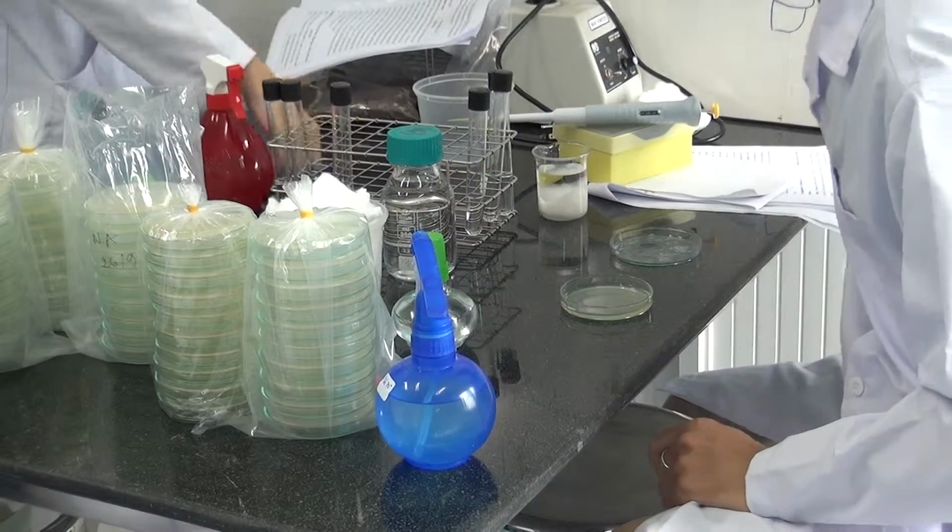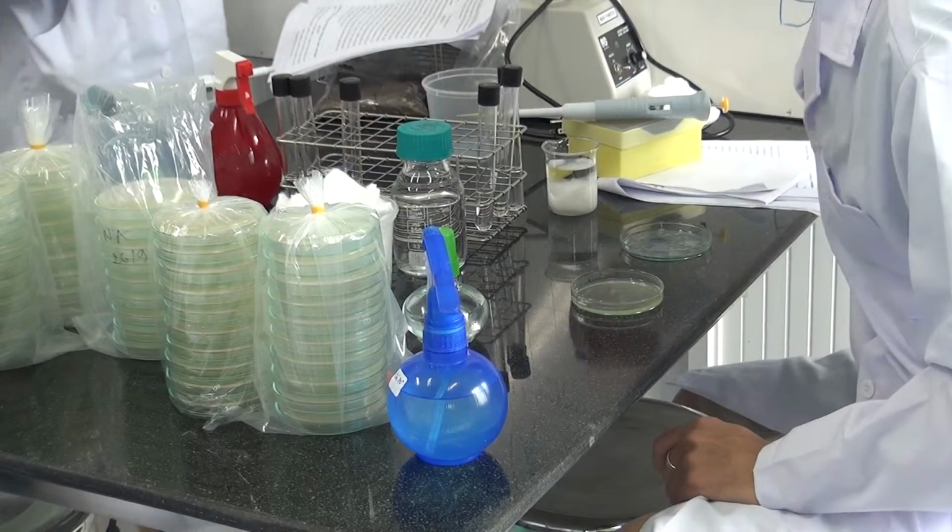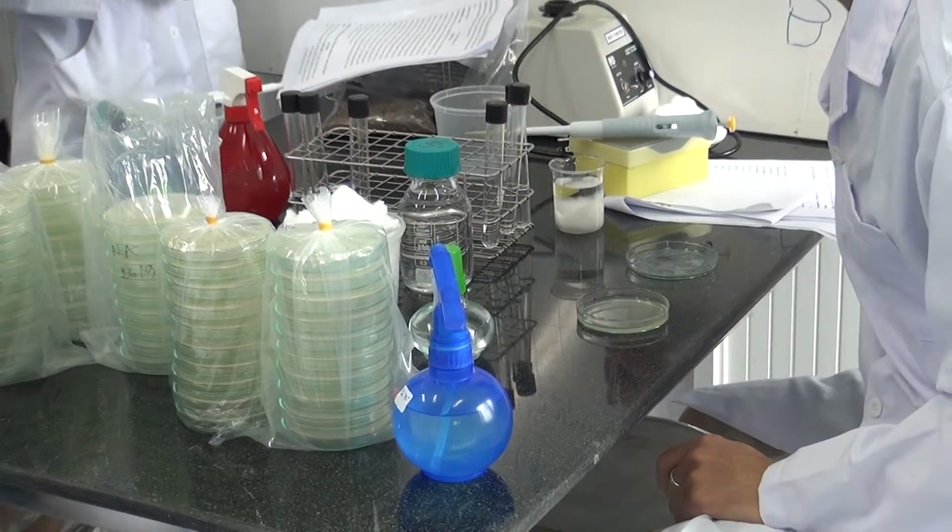What you would like to have in your plate after a day or 2 days is colonies.